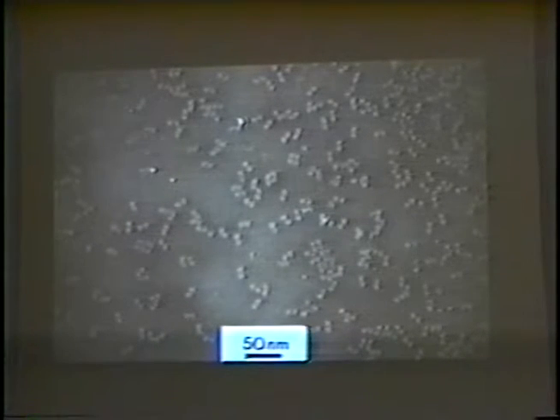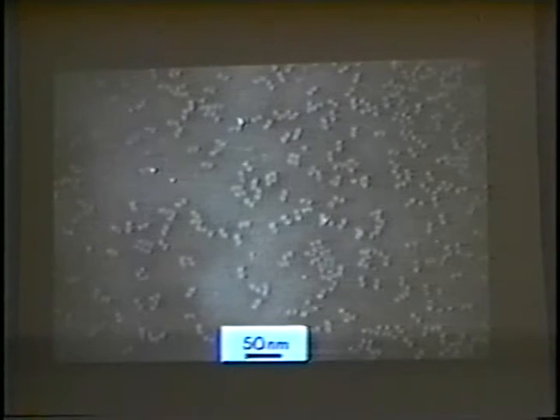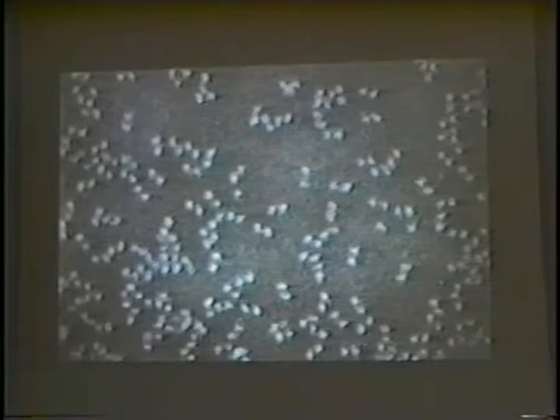This enzyme gives a double dot image in sodium phosphotungstate. This is because alpha-mannosidase is a dimeric protein, not a ring of subunits. The biochemical support for the purity of this enzyme and knowledge of its subunit composition is very important when interpreting the EM images, and really this applies to all purified proteins. At a slightly higher magnification, I think you see the double dot images with greater clarity.